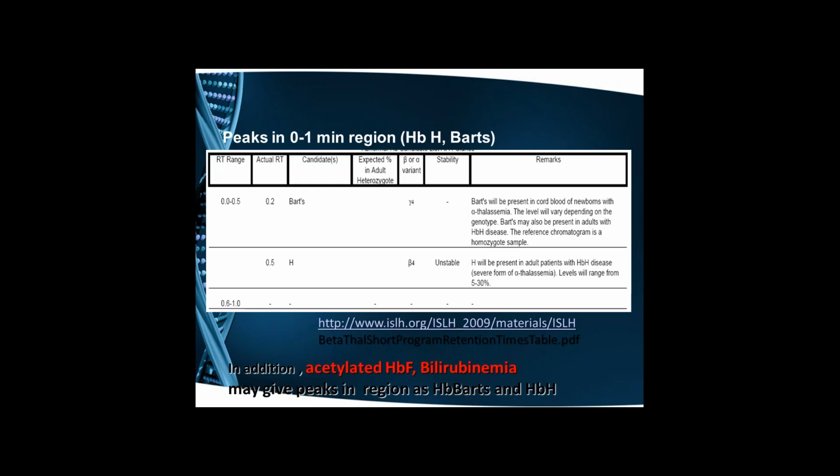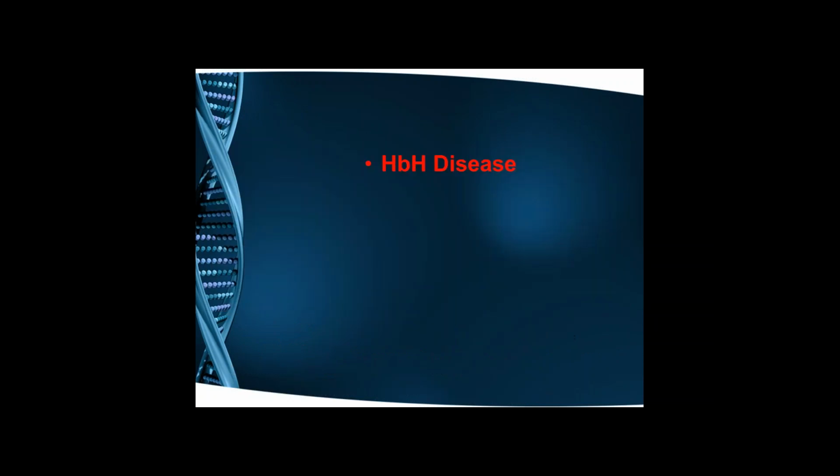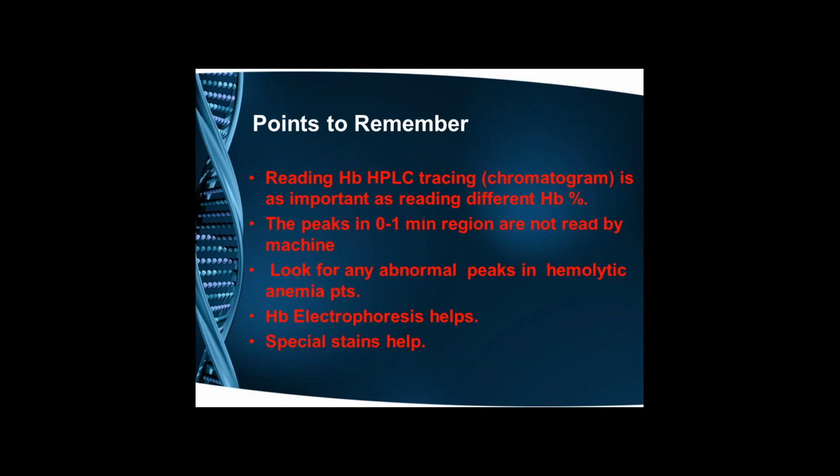The point of showing this case was that you should not always believe what the company has to say, because these machines don't pick up the peaks between 0 and 1 minute.